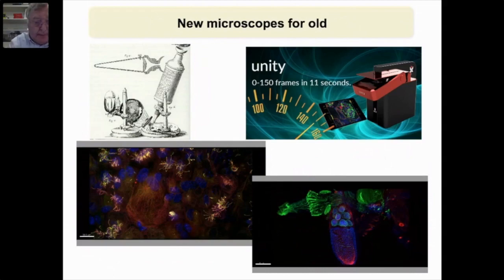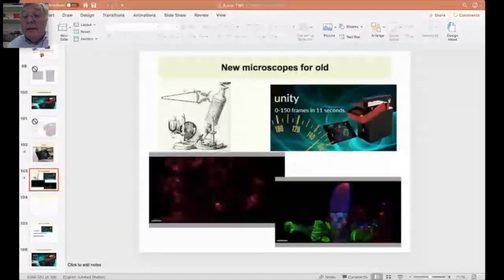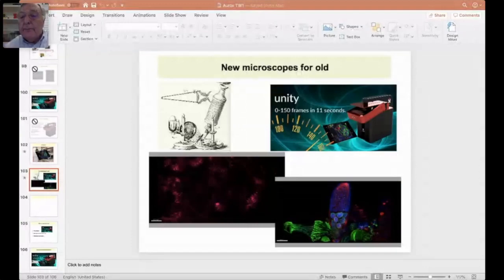Thank you, Tony. Entertaining as always. We have one quick question on our chat line. Jan Pechle is asking, can you give your personal perspective on Petran and Hadravsky's work? Early work on a Nipkow disc confocal?